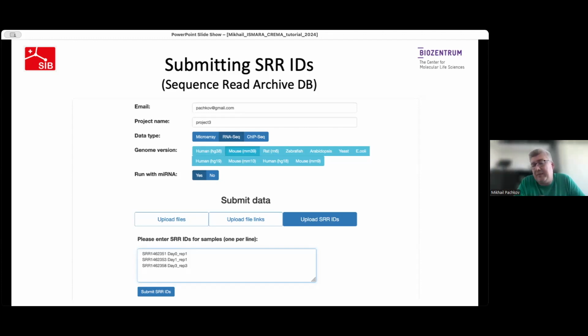So our tool, in the case of paired end sequencing, will download the two corresponding FASTQ files if the database record is for paired end data. Users shouldn't worry about this. They just give the database ID and that's all. Then on our side, we properly decide if it's paired end or single end.